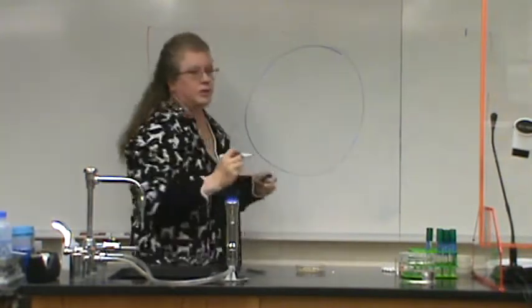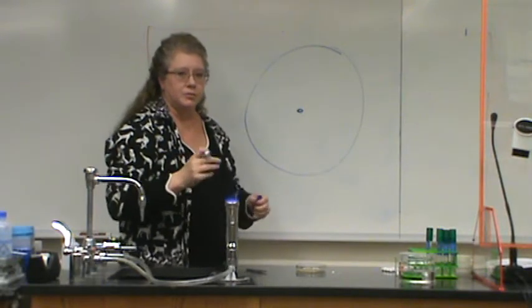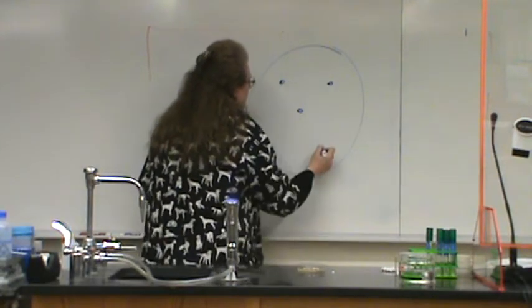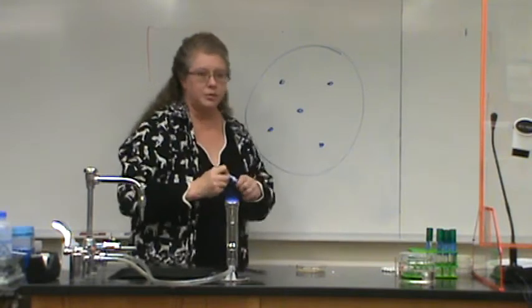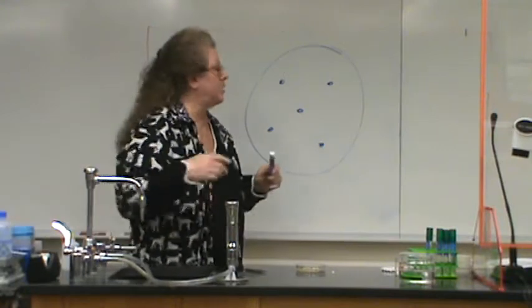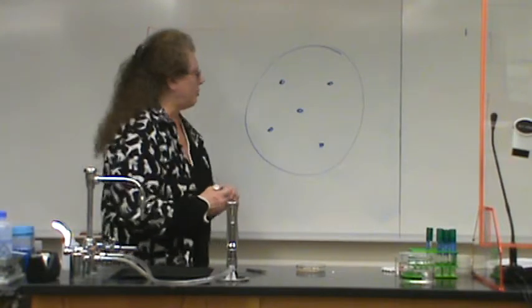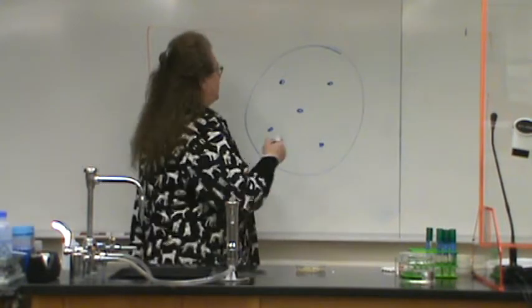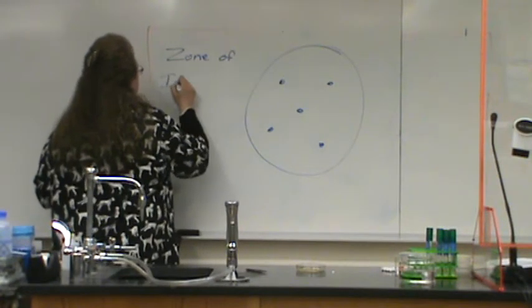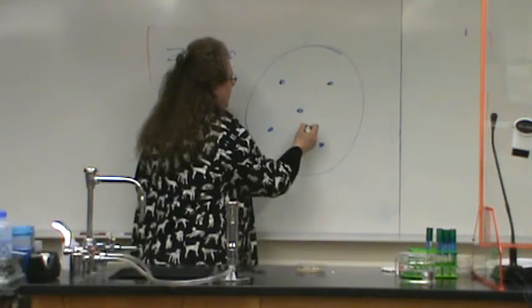All right, so the way we're placing the 5 on here is like a 5 on dice. If you've ever played with dice, the number 5. So you want one right in the middle. And then place them far enough away from the middle, but not too close to the edge. I'm going to go ahead and shut this off. That way, after incubation, you're not going to see it now because that lawn of bacteria has to grow up. After incubation, if there's a zone of inhibition, you will be able to see it clearly.